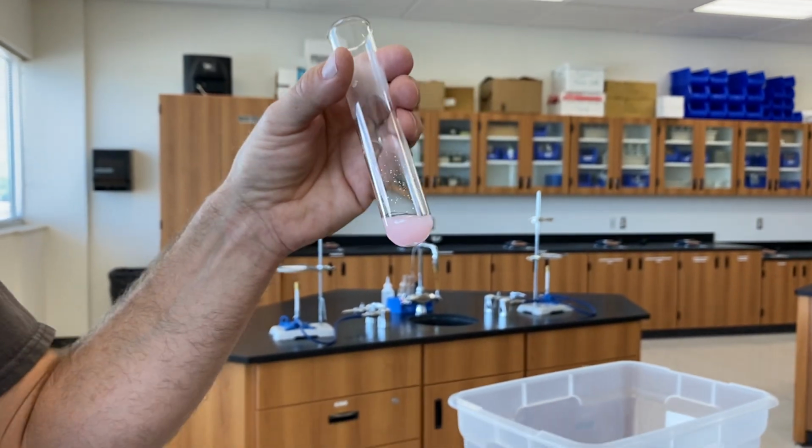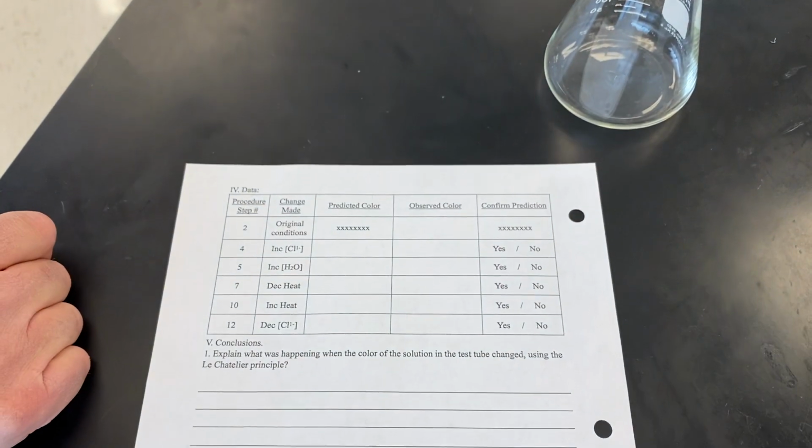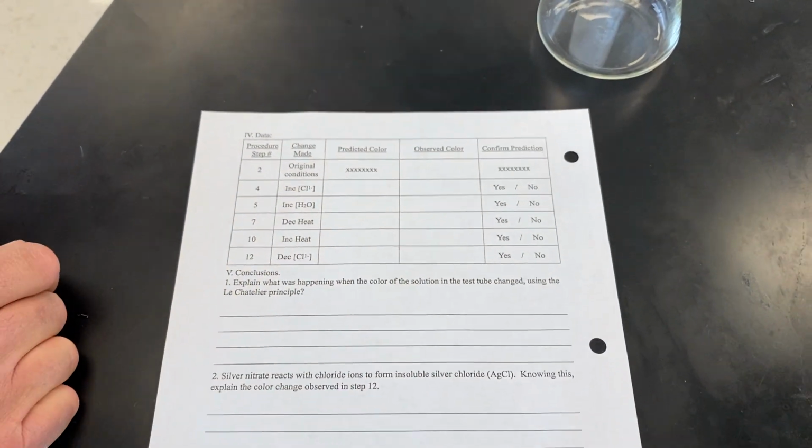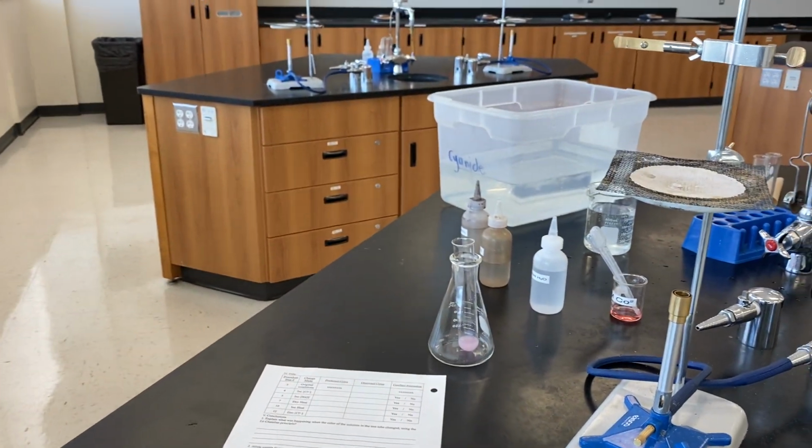Now what you'll do is in the data table, you'll compare your observed colors with your predicted colors, indicating whether or not we confirmed our predictions. Answer these last 3 conclusion questions in complete sentences, and turn the lab in next time.